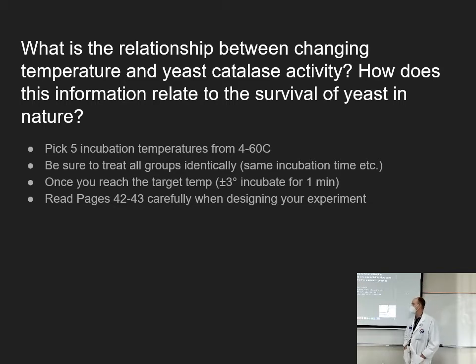So this week's lab continues the study of enzymes. We're still using catalase, yeast catalase, as we did last time. And rather than testing the effects of substrate concentration, which remember the substrate is hydrogen peroxide, on the rate of reaction, we are going to test the effect of temperature on the rate of the reaction.